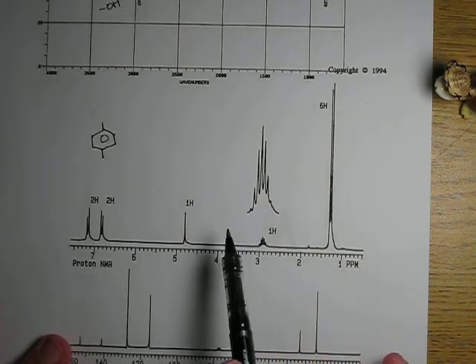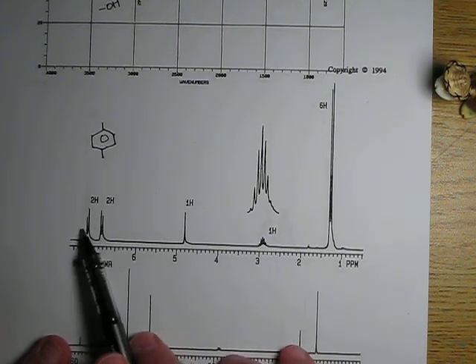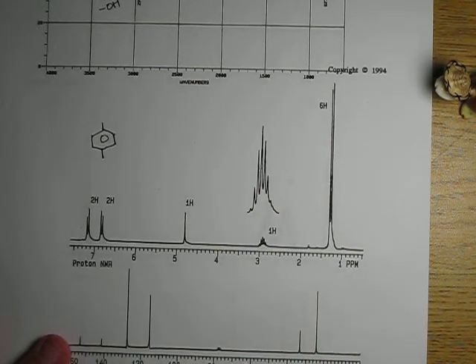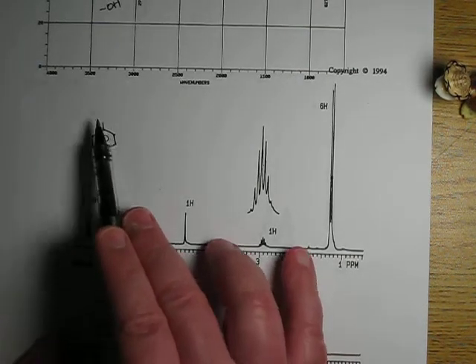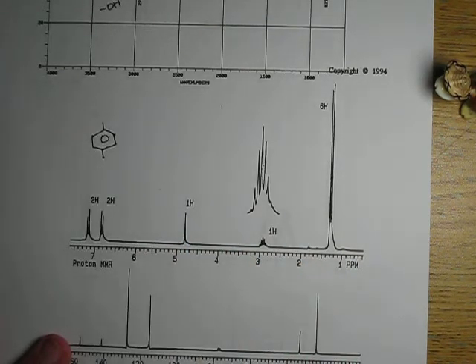There's something else that a lot of people don't tell you about, but I will because I think you're worthy. Whenever you see resonances of a benzene ring come a little upfield of 7, 6.8-ish or so, that almost always indicates that there's an oxygen or nitrogen bonded to the benzene ring. Every time I have seen NMR resonances belonging to a benzene ring upfield from 7 a little bit, there's always been an oxygen or a nitrogen bonded there. So there's either, I bet, an oxygen or a nitrogen bonded there. I don't know for sure, but that's my guess.